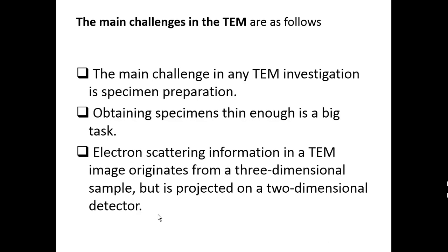Now, what are the challenges? Challenges means the difficulties faced in TEM. The main difficulty in TEM investigation is specimen preparation. I told you the specimen has to be prepared as a very thin film, of the order of 10 nanometers to less than 100 nanometers. Such a thin film has to be prepared. So specimen preparation is a challenge. It's a difficult thing. Obtaining a specimen thin enough is a big task.